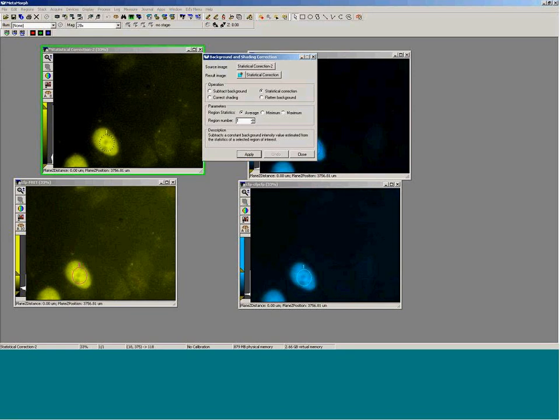Okay, so Sung Hein Chen asks, as far as the background being uneven, how do you deal with that for correction? That's your correct shading calculation, so you will need a background image and a shading correction image. The background image is typically acquired with no light going to the sample, so you're subtracting out any electronic noise. For shading images, you'll need a shading slide.